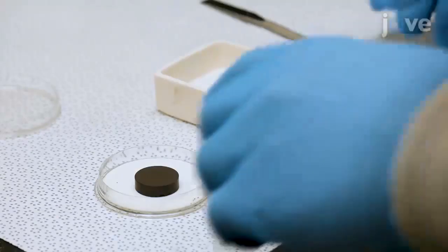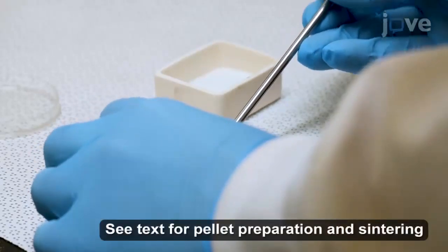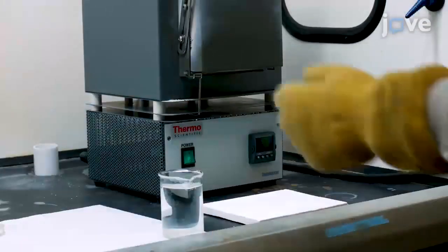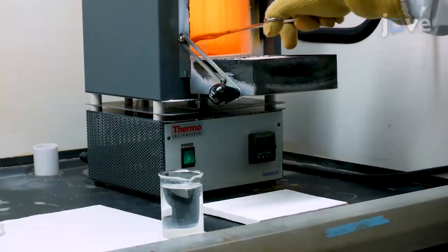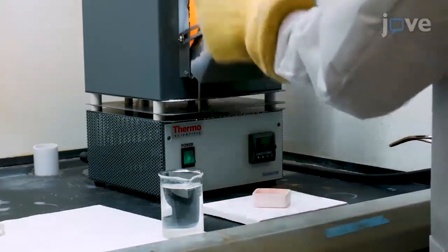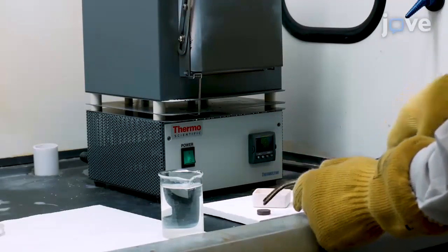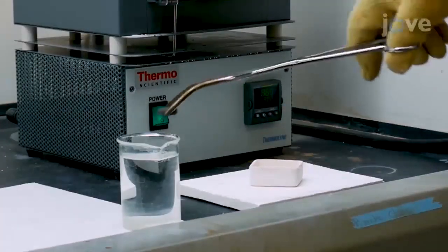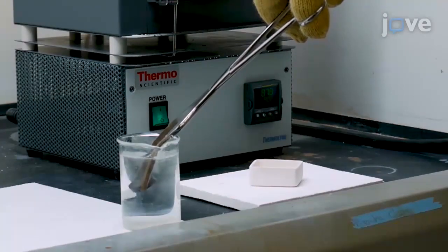First, grind the required oxide powders and use a die press to compress the powder into a pellet to form the target. Sinter the target in air at 1100 degrees Celsius for 24 hours. Then, while still at 1100 degrees Celsius, remove the crucible containing the target from the furnace. Use tongs to place the target on the same heat-tolerant surface. Wait for the target to stop glowing and quickly quench the target in room-temperature water.